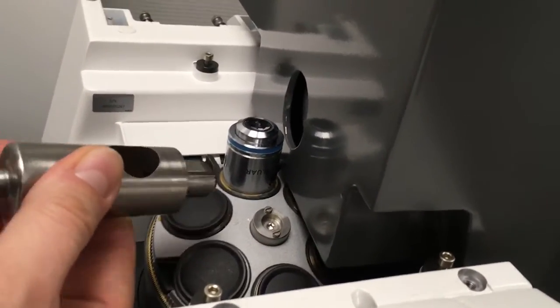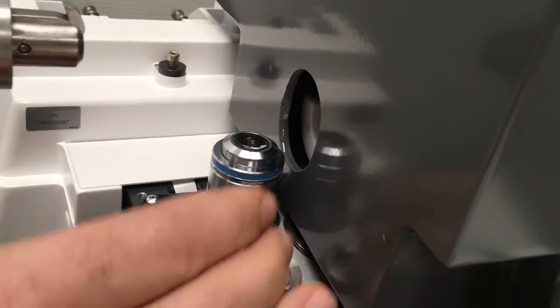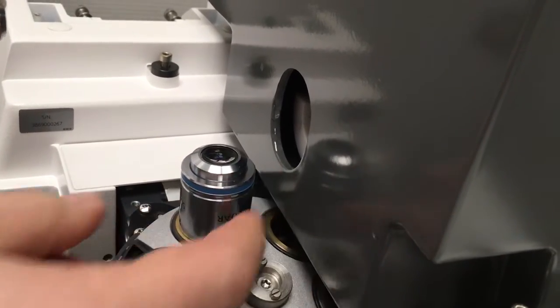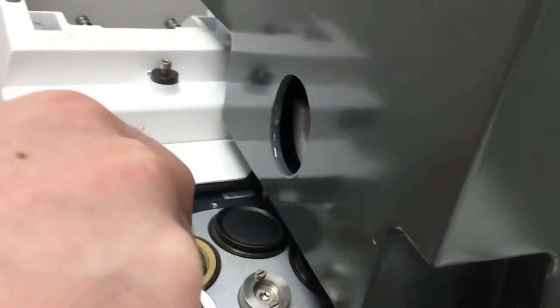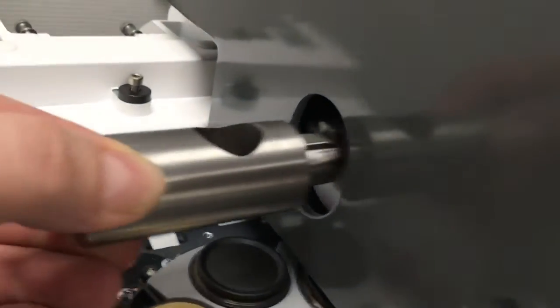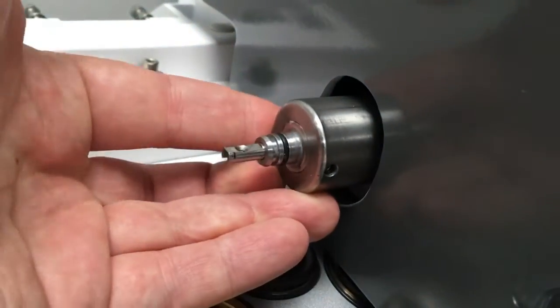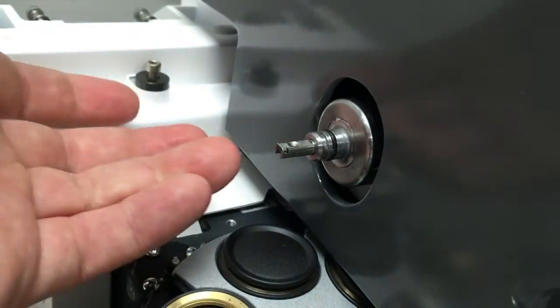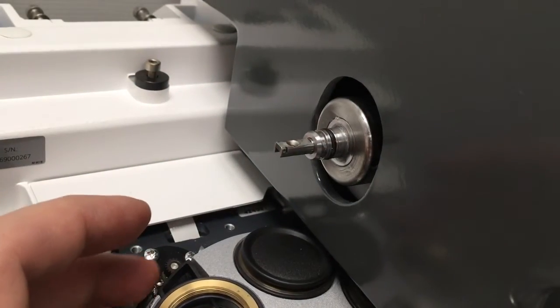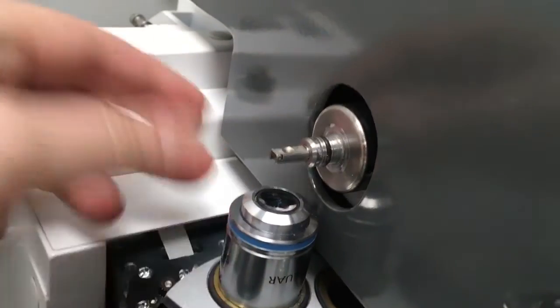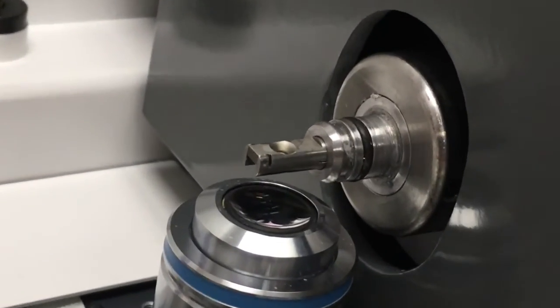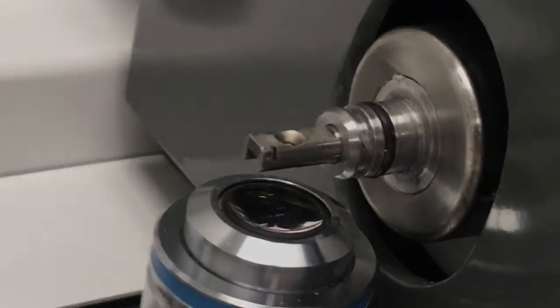Now the sample is ready and we can load it inside the machine. We remove the objective to avoid damaging it when inserting the sample, and then we get the whole thing plugged in here. The objective goes back in place and we can start imaging.